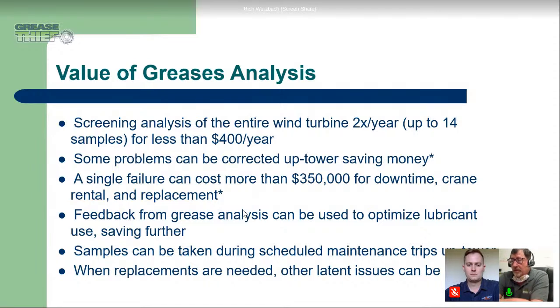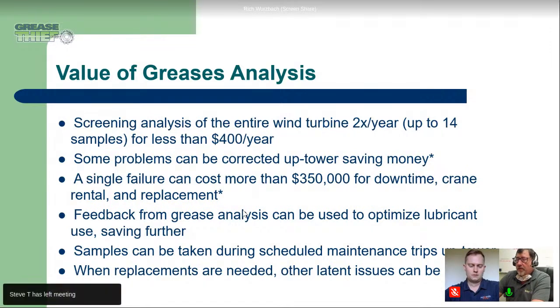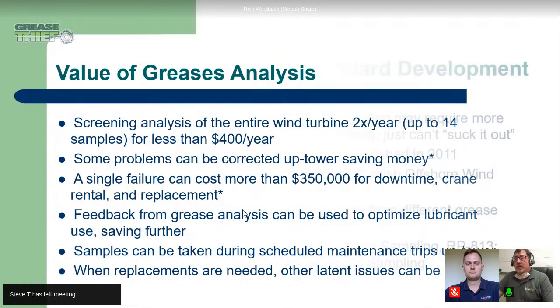And then, like you say, when the maintenance folks are out there, that's when we want to schedule the sampling, right? So we're already up tower, and really the differential cost to grab samples is not that great once you're already on site. So we've tried to make the tools very versatile, very accessible, and very easy to carry along on an up tower job. And that way, when some replacements are needed, other issues can be addressed at the same time. If we have gearbox issues, we can know, hey, is there also something on those blade bearings or something like that?